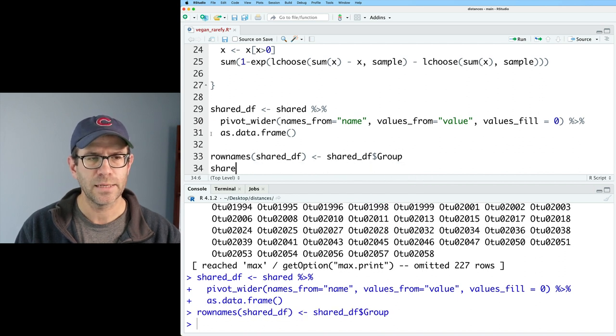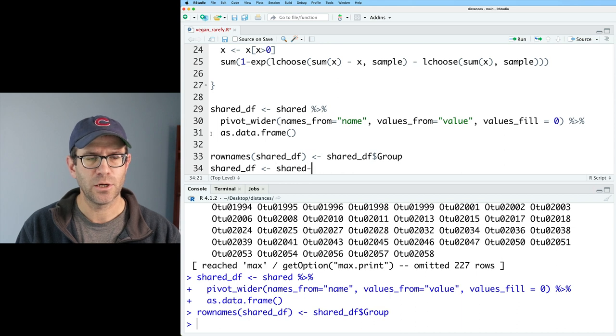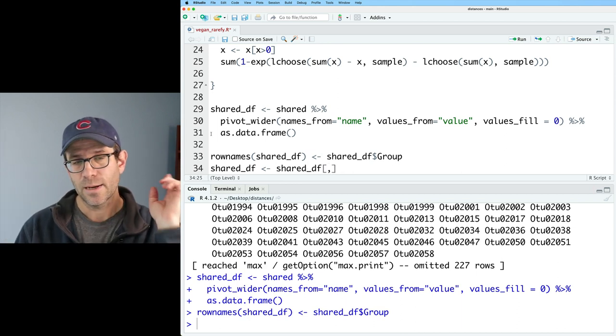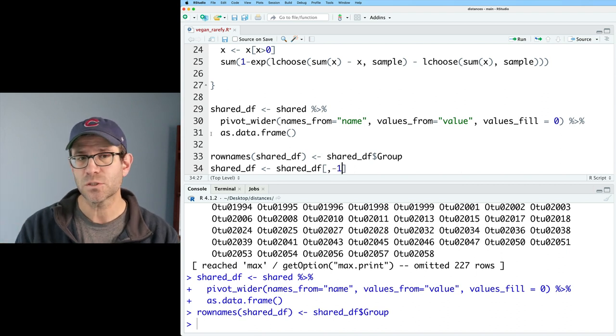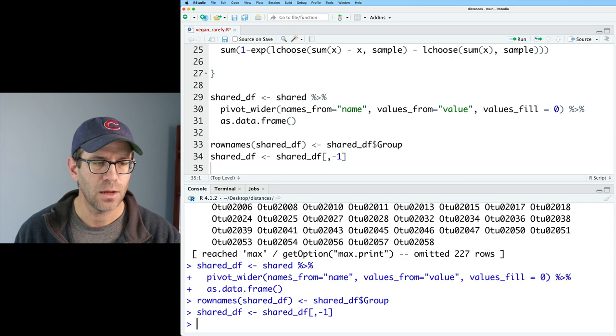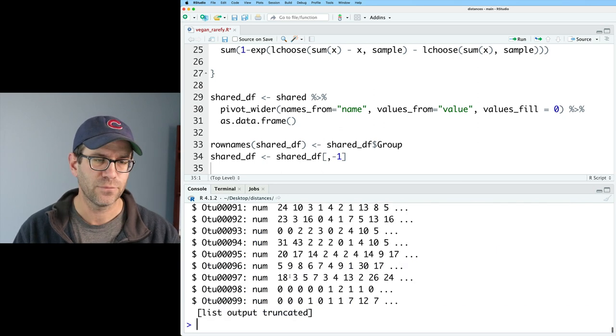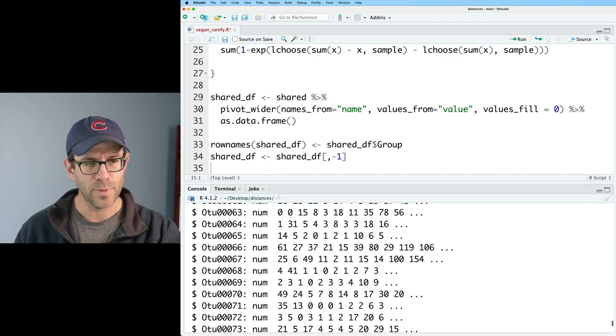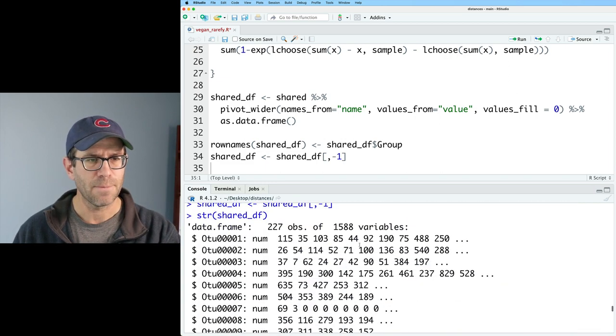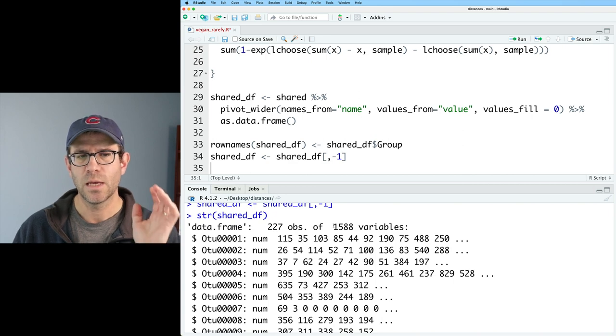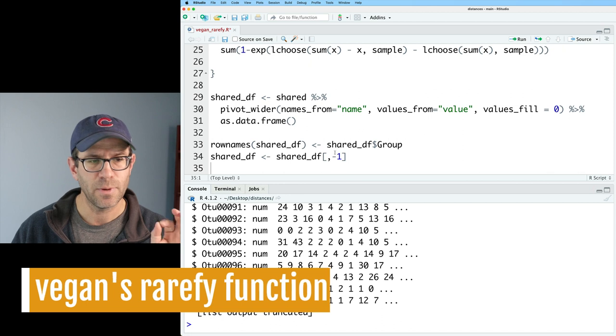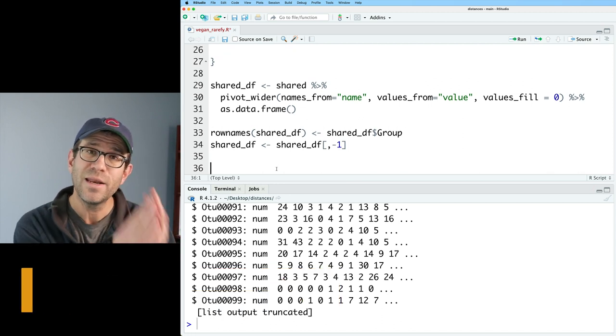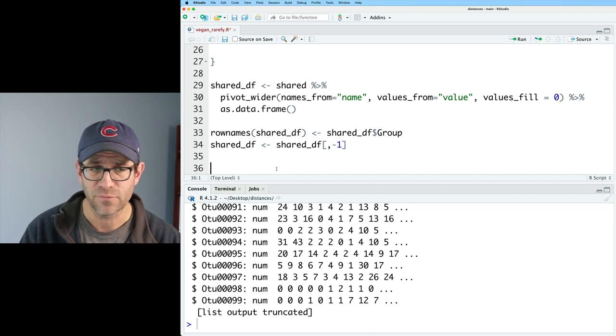And that's going to be shared_df$group. And then I can take shared_df and say that that is shared_df. And I'm going to use a square brace notation. And I'm going to get to the column, I'm going to say minus one to remove the first column from shared_df. And so now if I look at str on shared_df, I find that I've got all my different columns for my different taxa, the different OTUs. And I've got 227 rows and 1588 columns. So we're in good shape. That is now stored as a data frame. We're ready to take that now into vegan to do things like rarefaction.